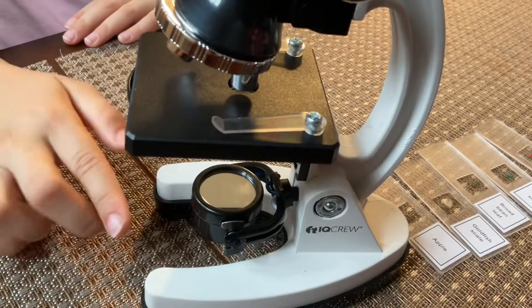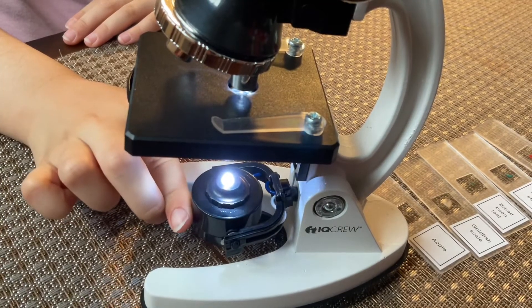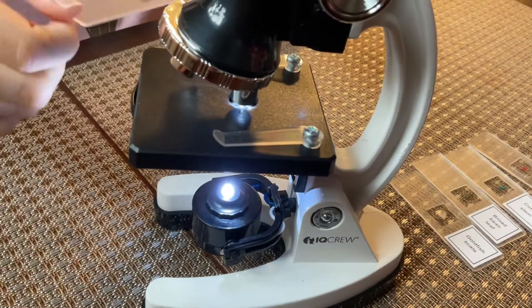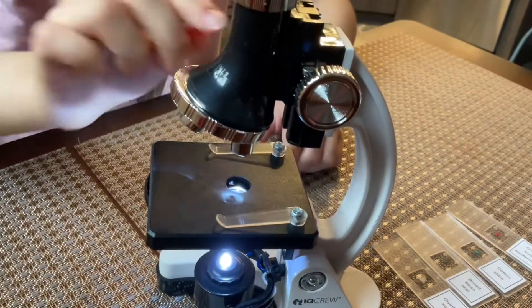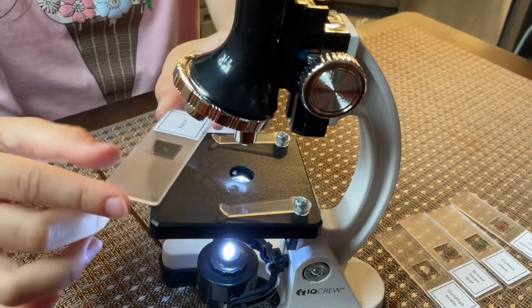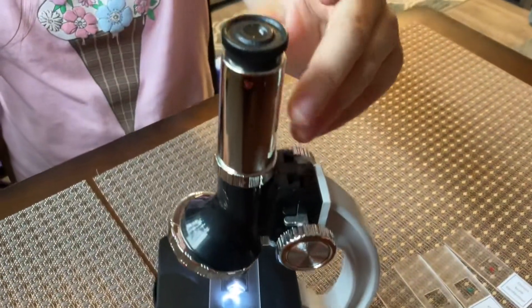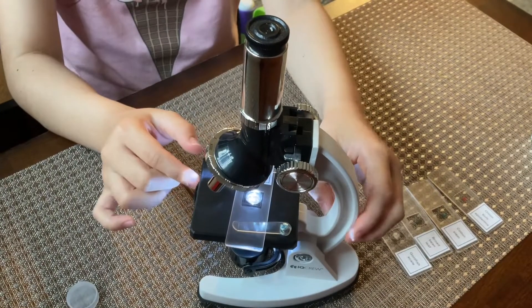After you put the batteries in, make sure to turn this around so you can turn on the light. And then you pick one of the slides — I picked the apple one. So you lift this up and turn the focus knob. You slide this in, take off the cap, and look through it here. You can adjust these things until you see a clear picture.